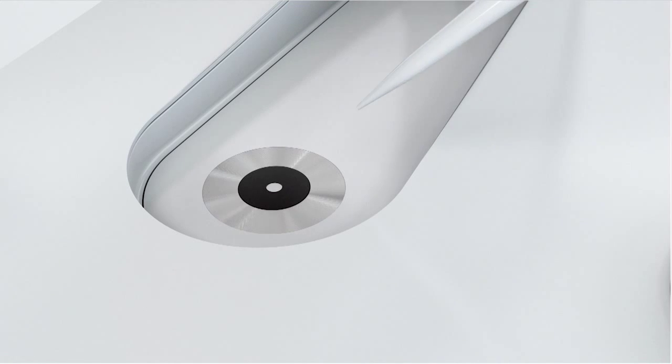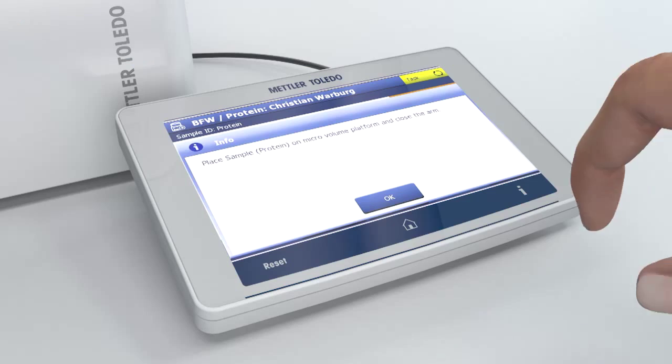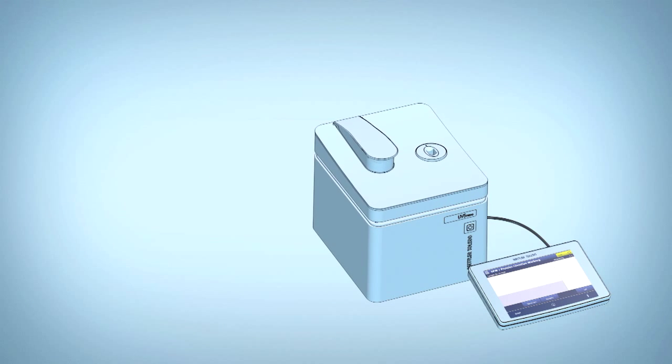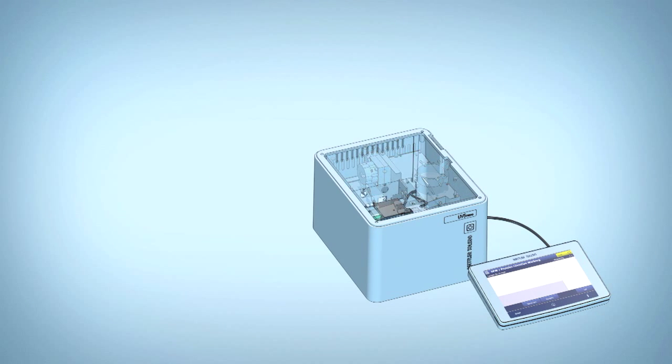A sample drop of 1 microliter volume is pipetted in a defined compartment on the optical cell surface. The mirror containing arm is then manually closed and automatically locked once the measurement is started.